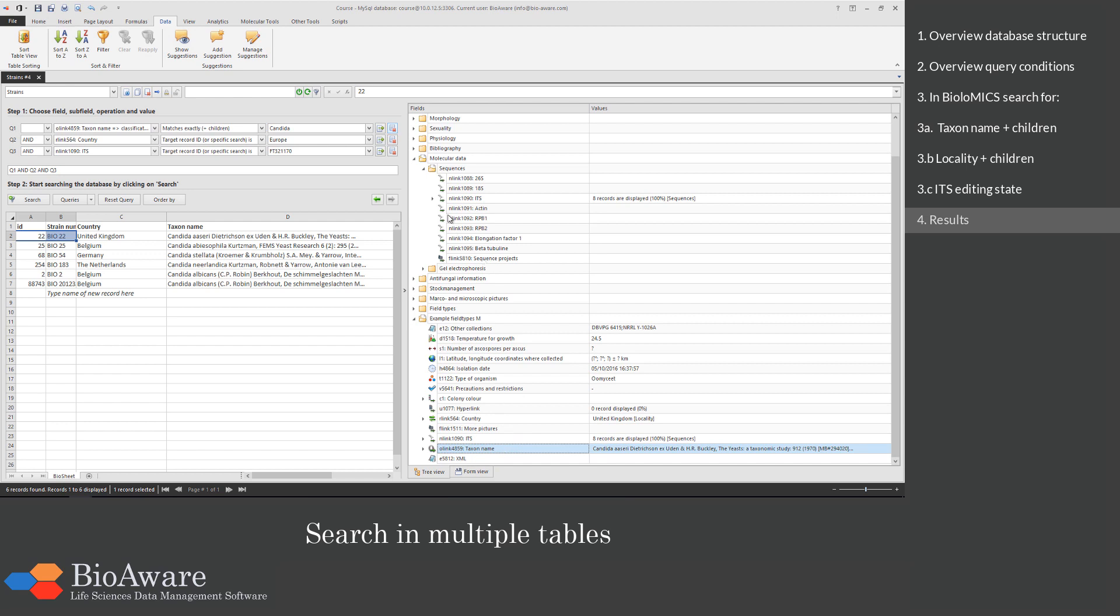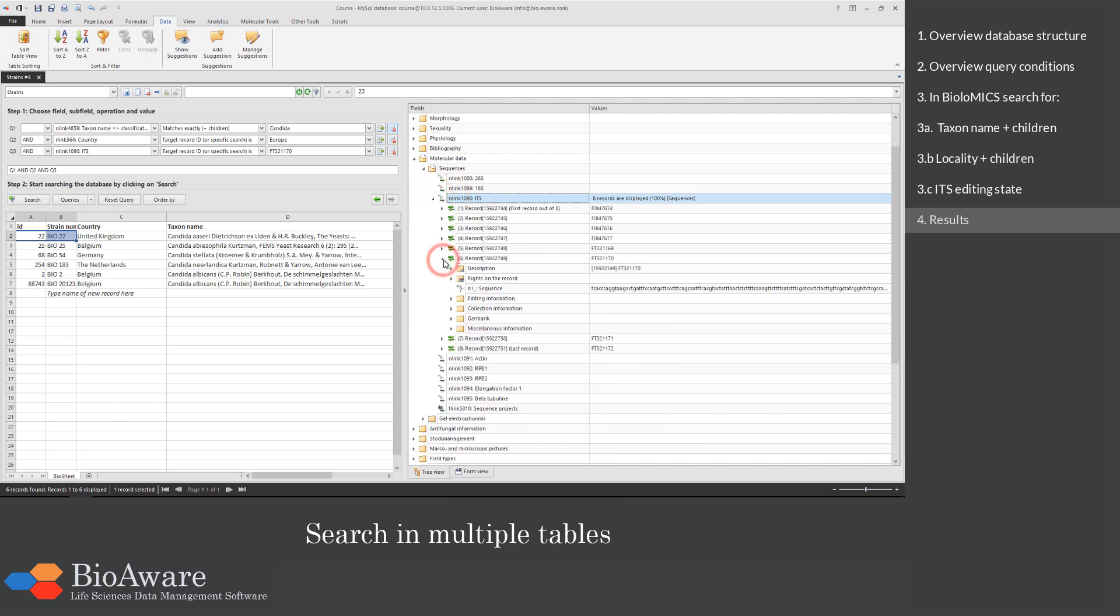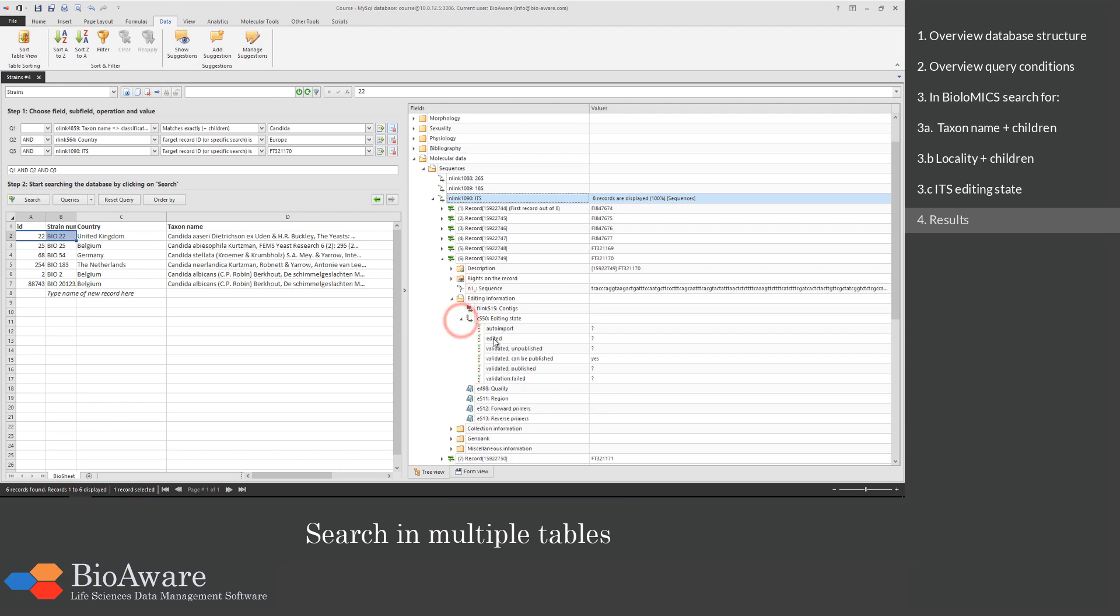And in the link field ITS we have a record, where the editing state of the validated can be published is yes.